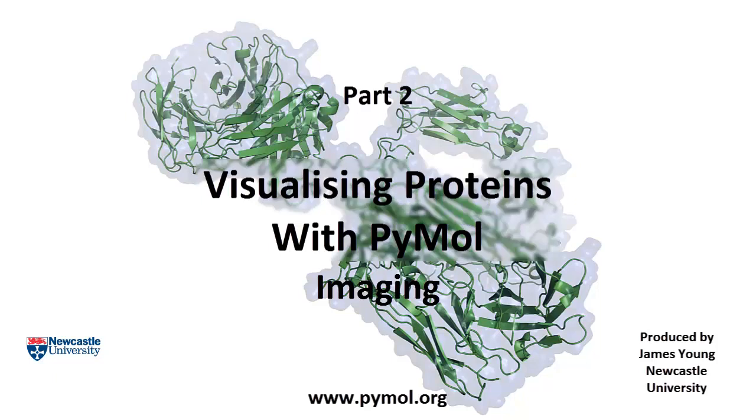Welcome to part 2 of my four-part tutorial series on visualizing proteins using PyMOL. Part 2 will focus on the basics of PyMOL, explaining how to create interesting images of proteins that are publication quality.